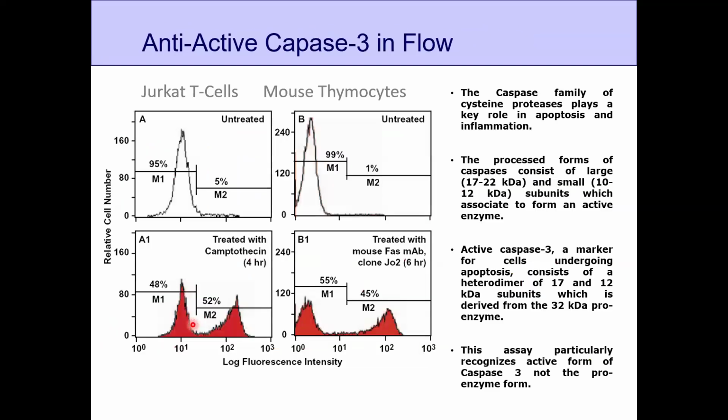This is another example where they have used caspase 3, which comes in the middle stage. So there is an early stage and there is a mid stage. This is mid stage apoptosis, because the caspase proteins start expressing inside the cells.